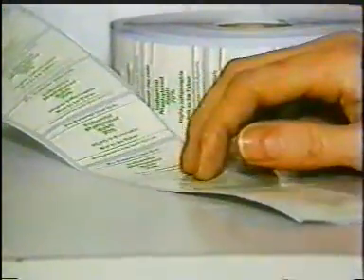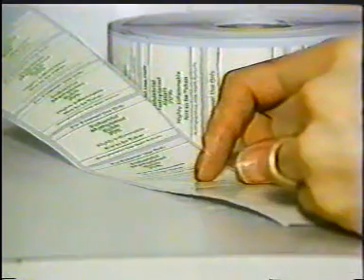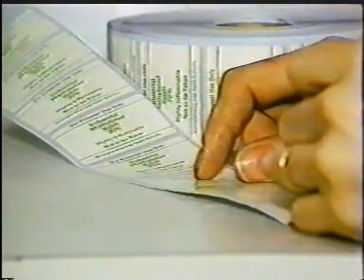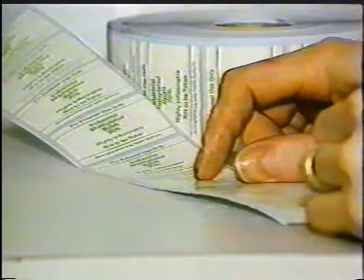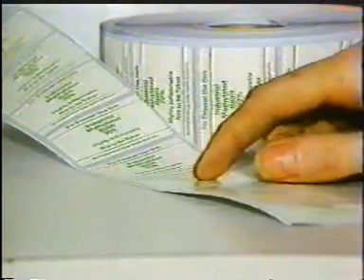Packaging materials include the labels that are to be applied to the final containers. Labels are treated in the same way as raw materials, being placed in bond on arrival until approved by quality control. Labels are checked for such things as spelling, legibility, and layout.